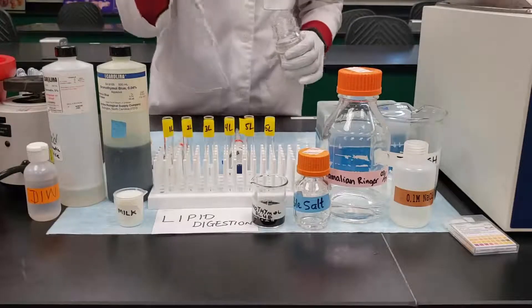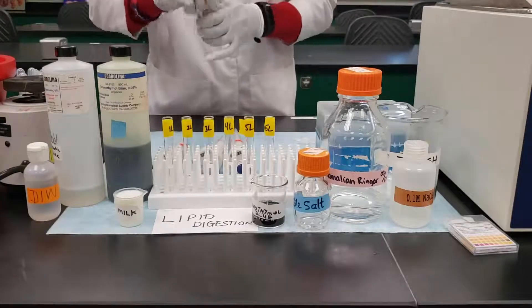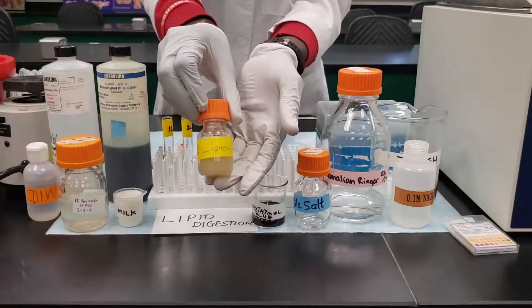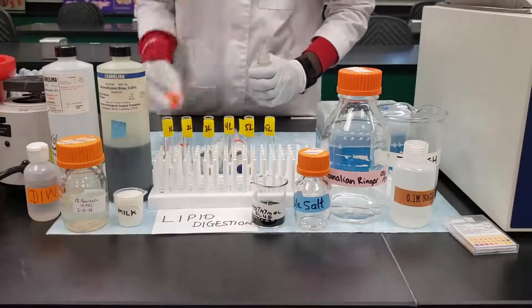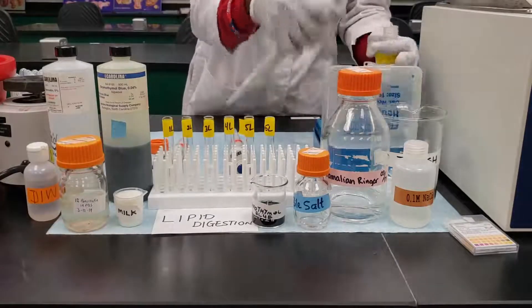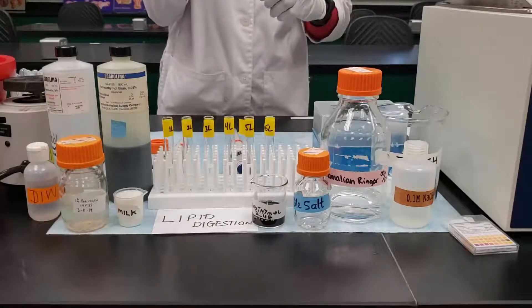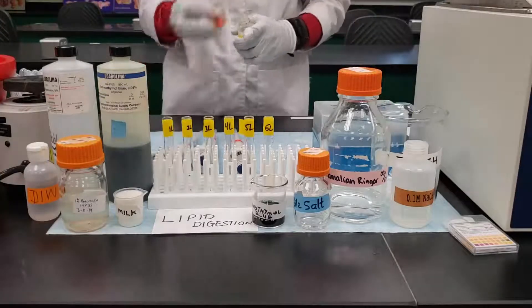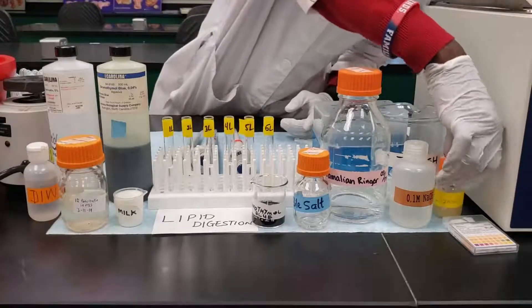After adding the pancreatic juice to tubes 1, 4, and 5, the next step is to add 1 mL of the lipase to tube 6. Remember, tube 6L will act as a positive control, so it's going to contain the lipase, which is expected to digest the fat within the milk we are using for this experiment.